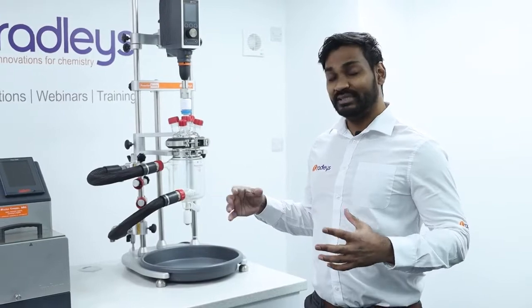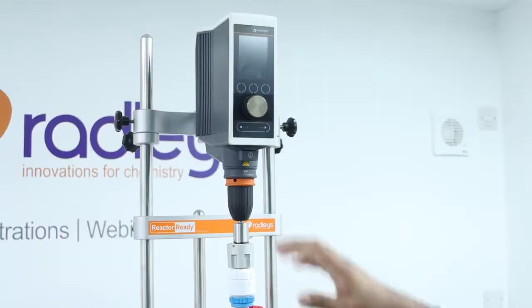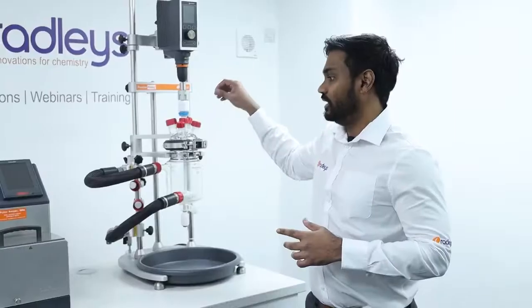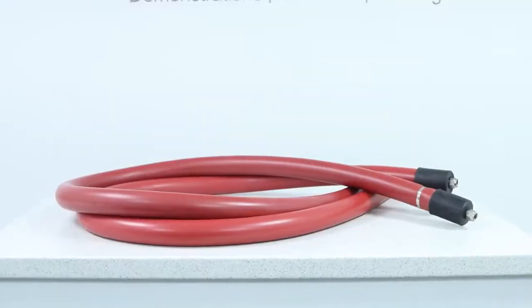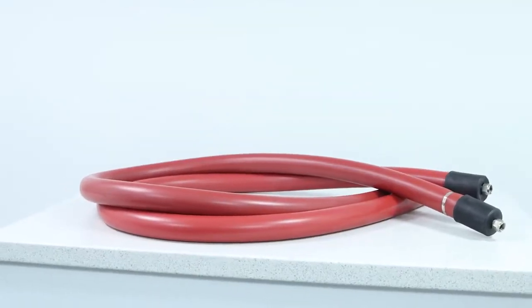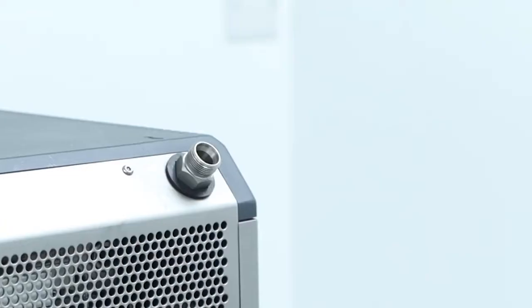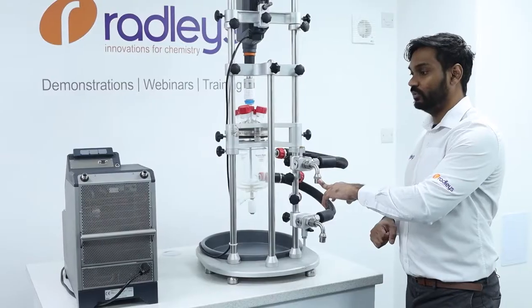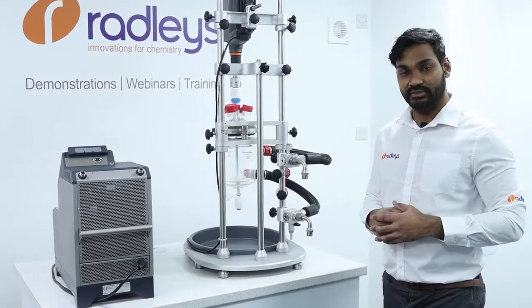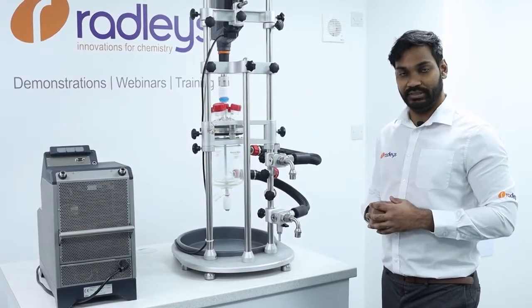We'll go through the components that make up the system. We've got our reactor ready set up here with a 1-litre process vessel, a Heidolf overhead stirrer, and a Huber MiniStat 230 as our circulator. We've got some Huber insulated hoses for connecting our reactor ready to our Huber. The hose connections on our MiniStat are M16 and the hose connections on our reactor ready manifolds are M24, and we have M16 hoses, so in order to join them up together we'll need some adapters.